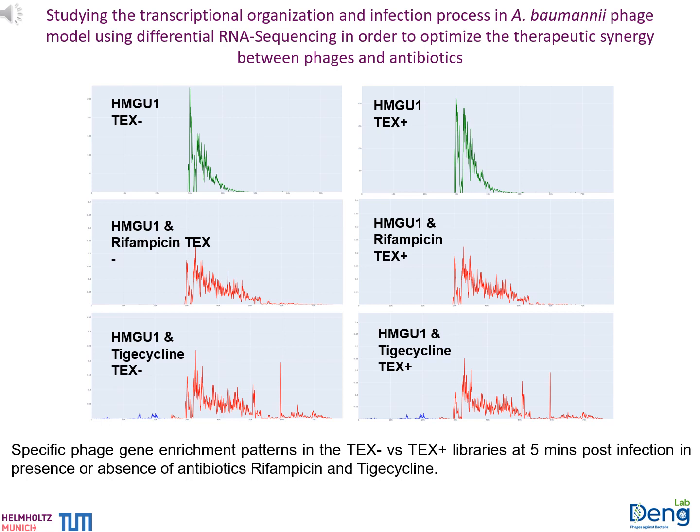For the analysis of the data, we use bioinformatic tools like ReadXplorer and ANNOgesic, which were specifically developed to generate annotations of genomes using a genetic algorithm and machine learning approaches that are trained based on user-curated, manually detected transcription start site prediction. So the input we would give the tools is the genome sequences, and we would apply different packages like the transcription start site, processing site predictors, or terminator predictors, which would then give us the carefully calculated and detected annotations of processing sites, transcription start sites, UTRs, terminators, and transcripts.